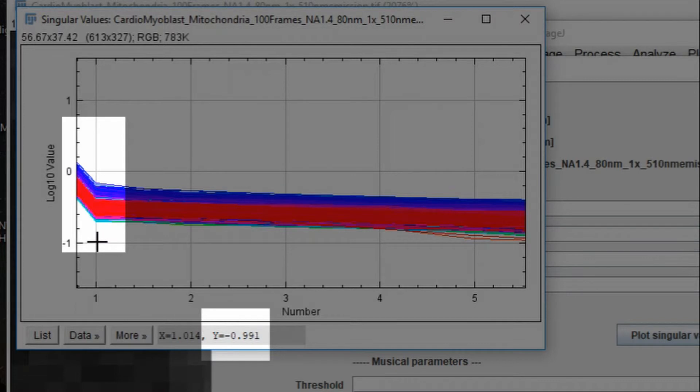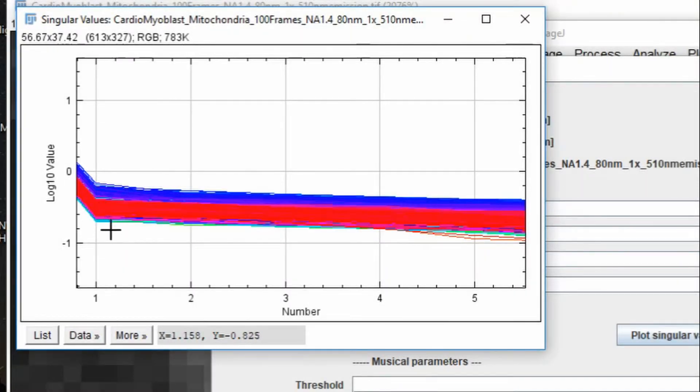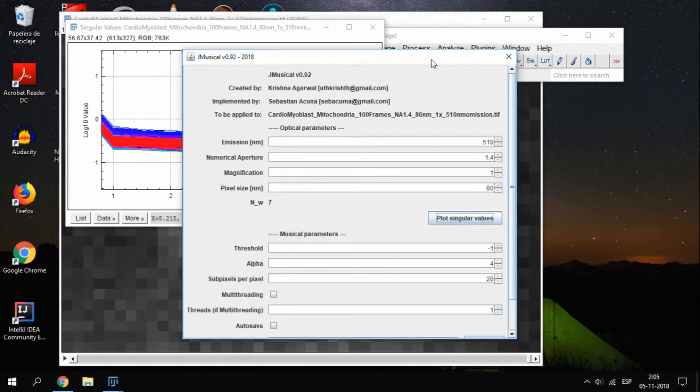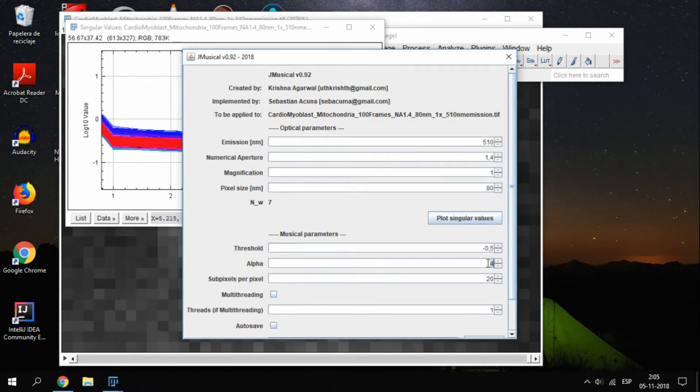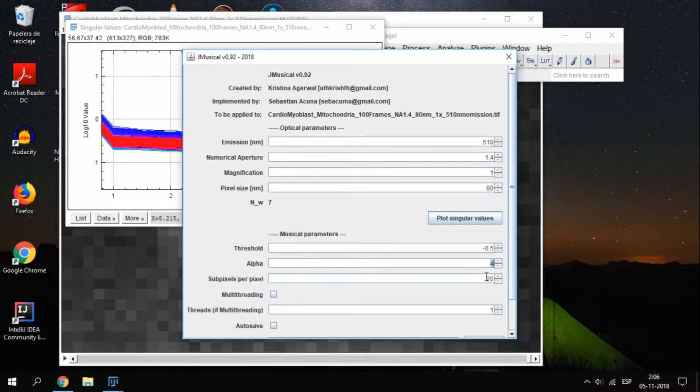We will use one in the middle, such as minus 0.5, but you could use something above or below. Once we have picked the threshold, the second step is getting the actual image using musical. The threshold is the value we noted before, so minus 0.5 in our case. Alpha is by default 4, which is the recommended value on the paper. It is related to the contrast, and you are welcome to play with it. In the paper, you can find a discussion of the effect of alpha in the final result.